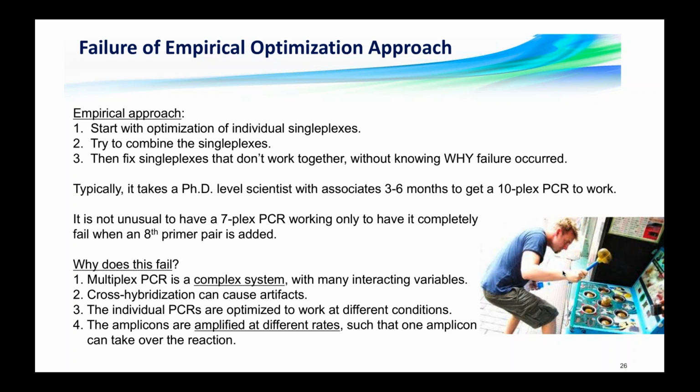the primers start failing. And it's just mystifying, and it becomes a whack-a-mole type of problem where you solve one problem and boom, another one pops up. You solve that one and a different one pops up. And this is the consequence of this one-dimensional linear approach to trying to solve one primer set at a time.